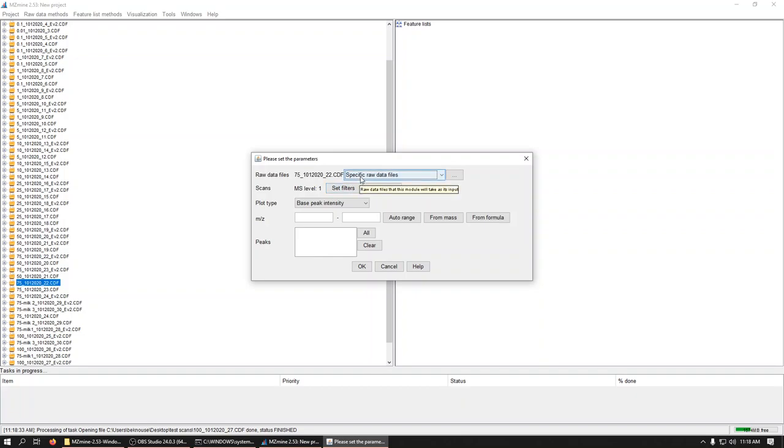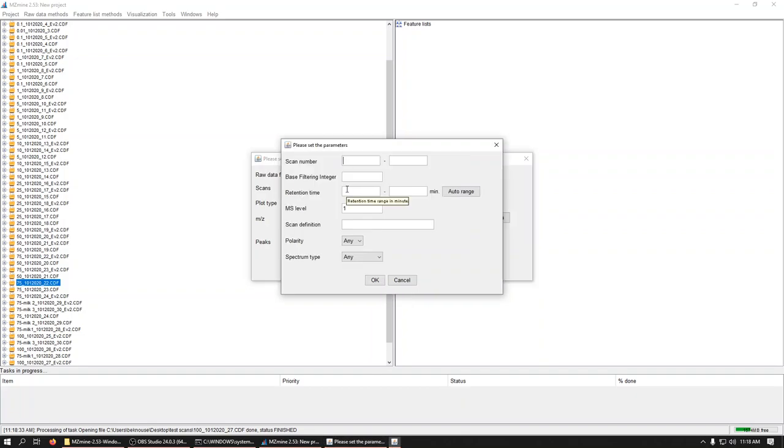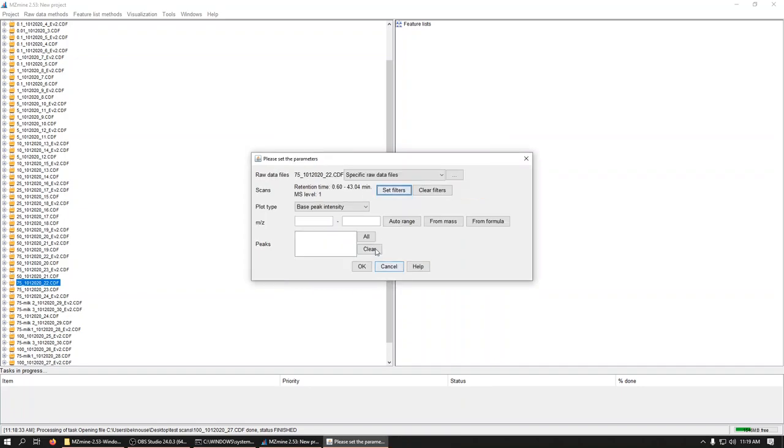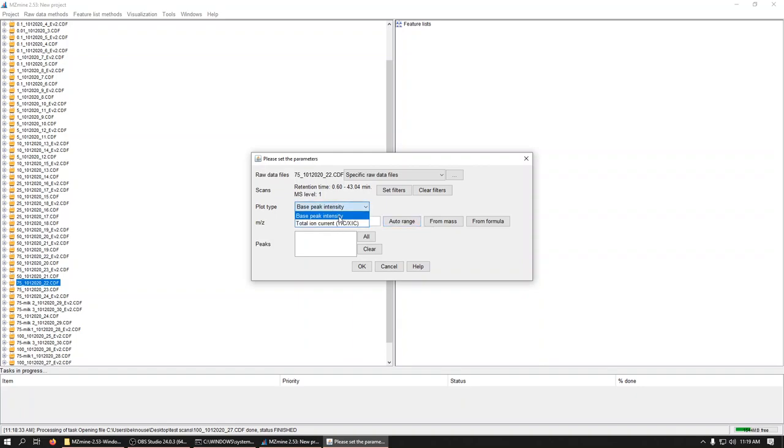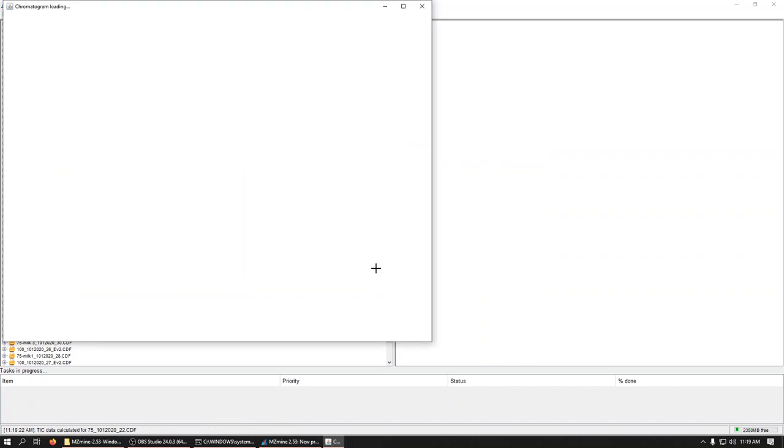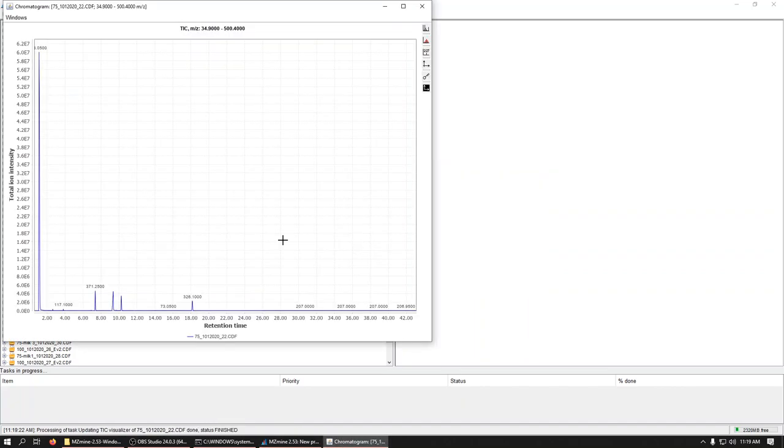And it'll ask for parameters. We've picked the raw data file. We're going to auto-arrange the retention time, so it'll just look through the data quick and pick beginning to end. And we'll do the same thing. We'll auto-arrange the mass. And it wants to do base peak intensity. What we're used to looking at is a TIC, a total ion. And we'll say okay.